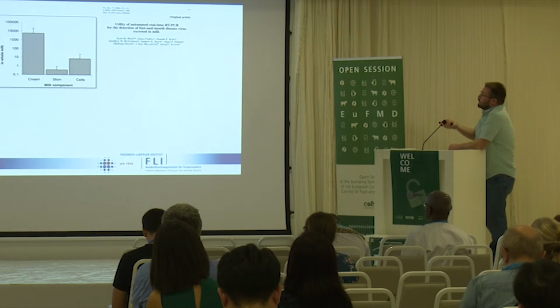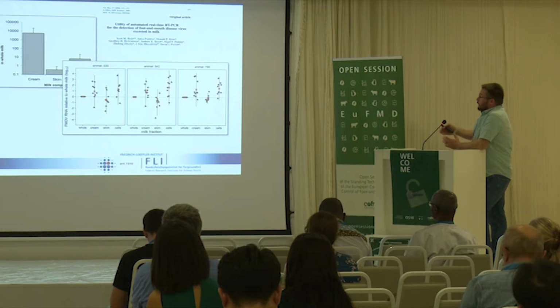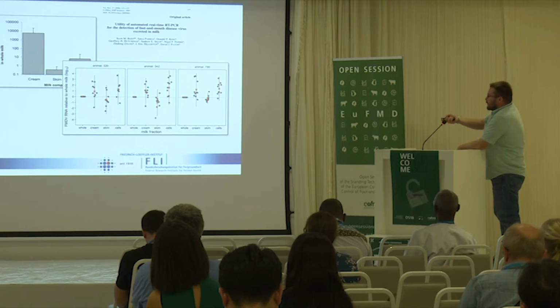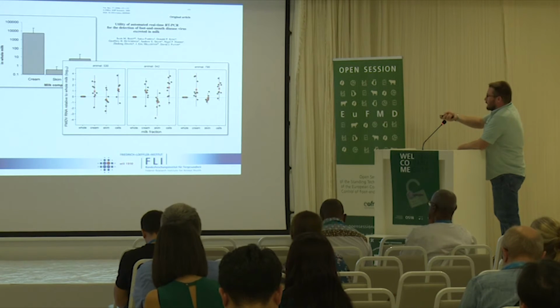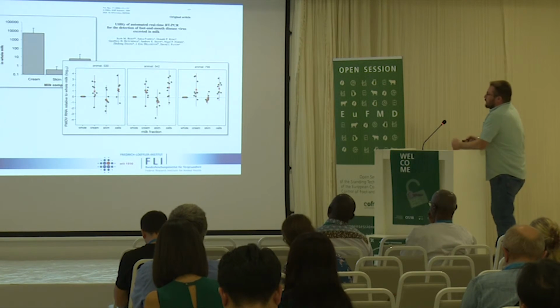So this has been published previously by Pirbright more than 10 years ago. Much higher detection in cream, a little bit worse detection in the skim milk, and a little bit higher maybe in the cells. With us, the differences were not quite that dramatic, but you can also see here that in general, in the cream, the detectable RNA content was a little bit higher than in the whole milk, whereas in skim it was a little bit lower. So essentially the same pattern, if not as pronounced.